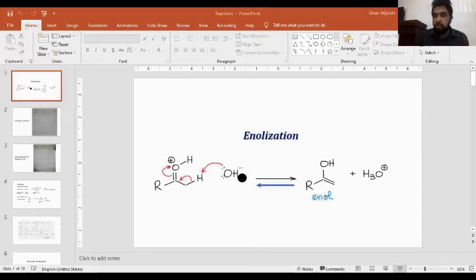So we boil to mix the two solutions properly, and you have observed that when we were doing the experiment, fructose gave the positive result within a very short period of time. That's because fructose has the highest reducing power compared to the other sugars that we used.